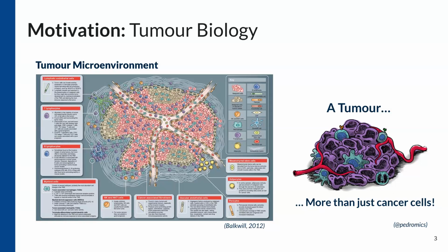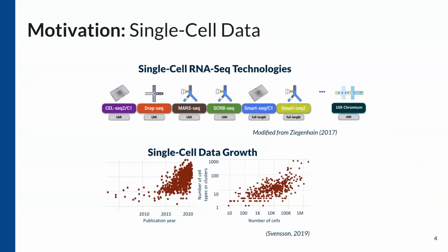Something that we can do to delineate this heterogeneity is this cool new lab tool called single-cell RNA-seq. Similar to RNA sequencing, we get the gene expression of cells through mRNA transcripts. Something neat about single cell in recent times is that there's a whole bunch of different techniques you can do.